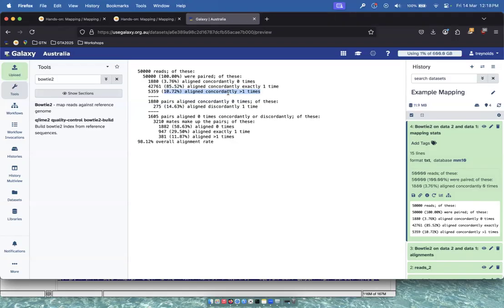These are called multi-mapped reads, and it can happen because of repetitions in the reference genome, as in multiple copies of a gene, for example, particularly when the reads are small, which is the case here. It is difficult to decide where these sequences come from, and therefore most of the pipelines ignore them. Always check these statistics to be sure of not discarding too much information in downstream analysis.